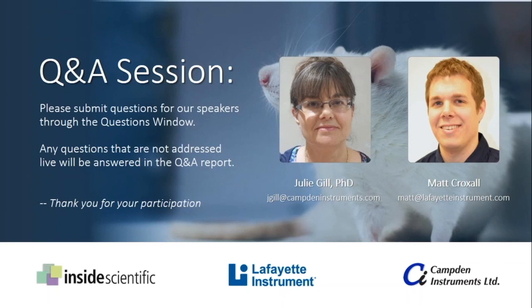Perfect. And maybe this leads into the next question too about the pre-programmed or canned tasks versus one that one can program for themselves. So I assume that the canned tasks can be modified for difficulty level, for example. Yeah, absolutely. The whole thing is open, and because it's quite a user-friendly programming way of doing things, it's quite easy to go in there and change things.